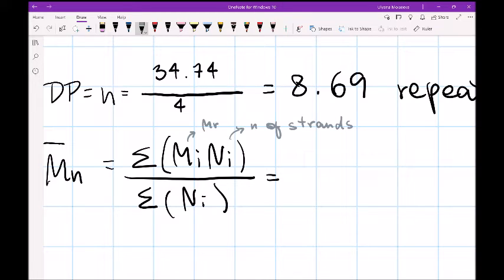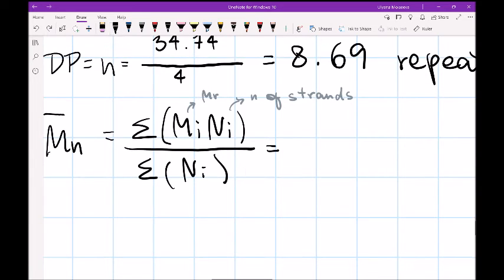We have only one polymer that we are discussing now. The N is usually useful to know when you have polymer of different size strands and different numbers of these strands. But since we are talking only about one polymer, for us N will be equal to 1.